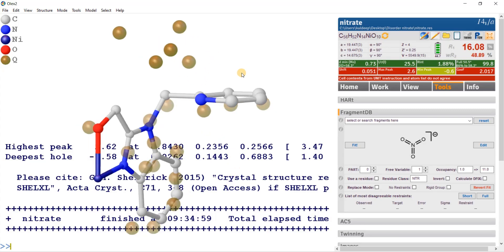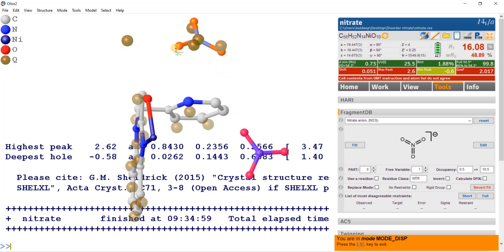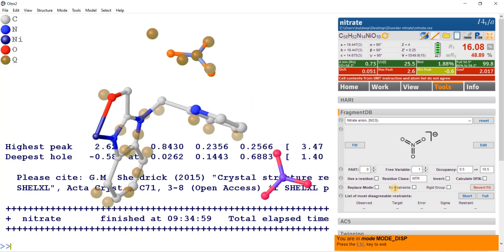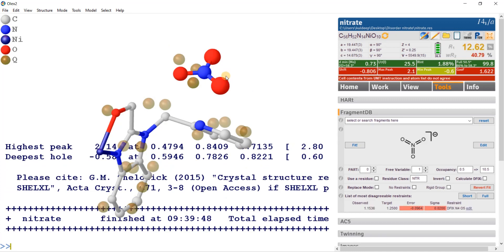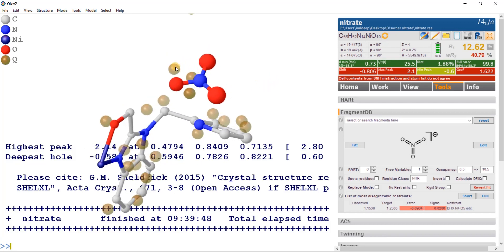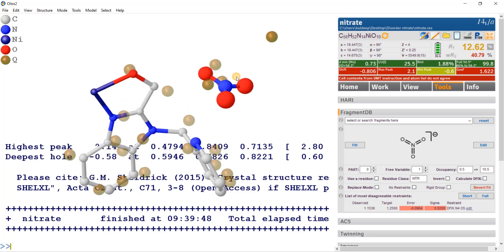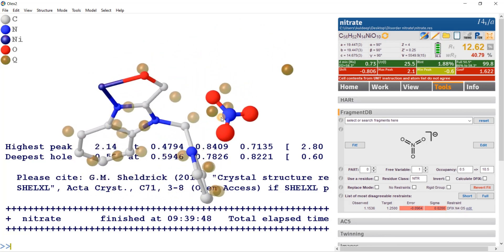This nitrate is only half occupied, so I will use occupancy 0.5. I am going to fit: this nitrogen here, this oxygen here. Moving with the mouse — now it is almost fitted nicely. Escape. Refining with Control R — now you can see the thermal ellipsoids are reasonable, but there is some electron density appearing between the oxygens. So this nitrate is disordered. How do we model this disorder? We will use the PART function: PART 1 and PART 2.